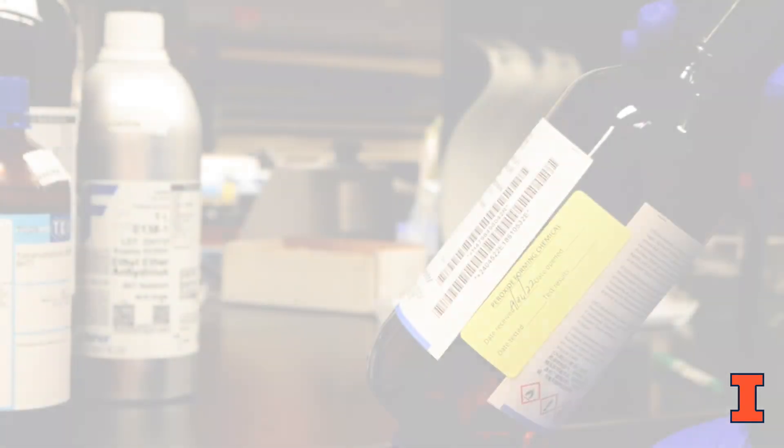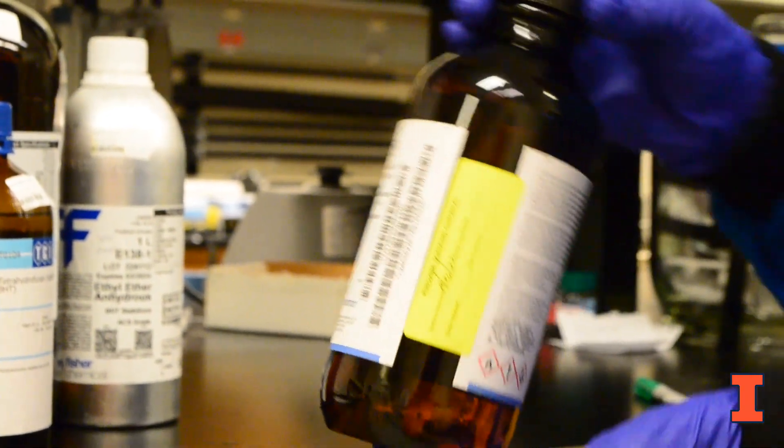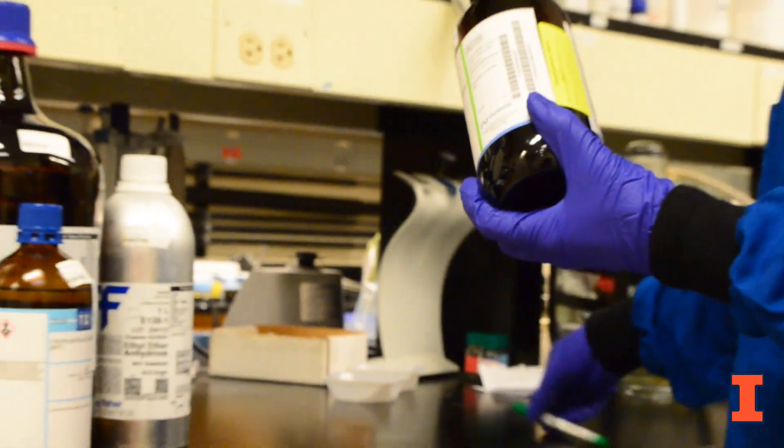There are many ways to manage the risks associated with peroxide formers. One way is to record the date received to keep track of the age of your chemical and the date opened to know when to test.